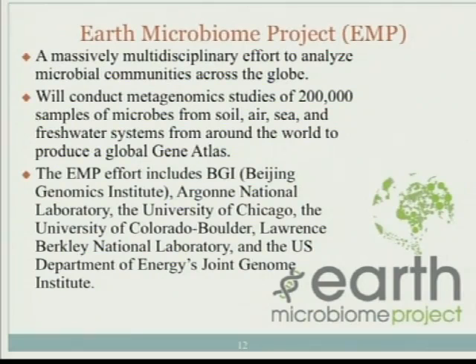But the general idea is that we can use degenerated primers that can target those conserved regions from 16S RNA genes, so that hopefully you will be able to amplify gene fragments from all different 16S RNA genes from all different kinds of microbial organisms. So that's what we hope. But you do expect there will be some bias in those data sets you get.